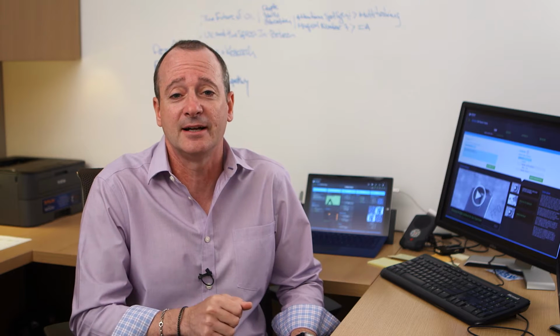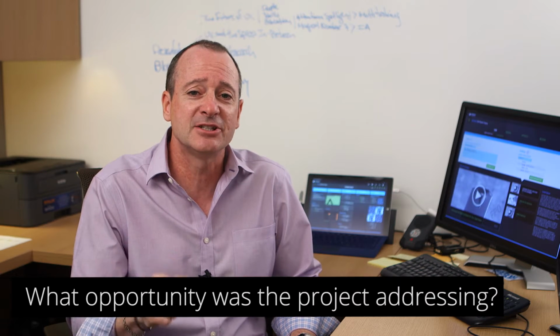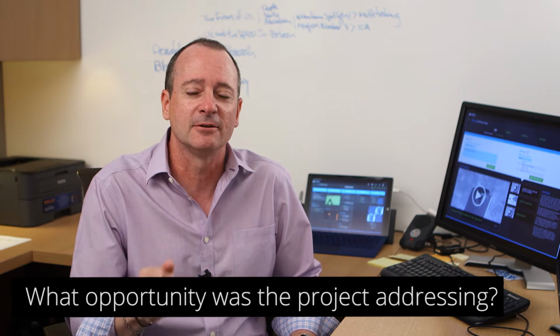I'm Kevin Richardson, Director of User Experience at Infragistics. My colleague Ken Eisenhuth and I were asked by Keysight Technologies, one of the world's leading electronic measurement companies, to redesign the software that controls their line of atomic force microscopes.